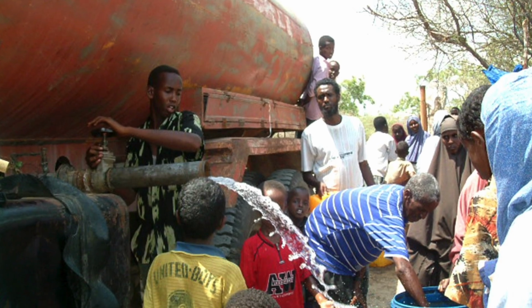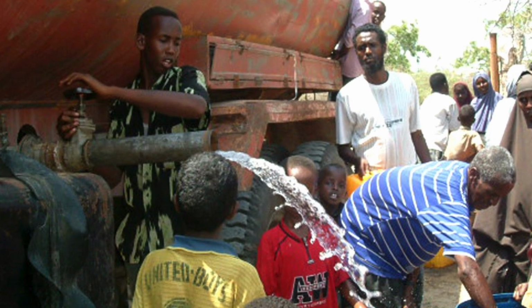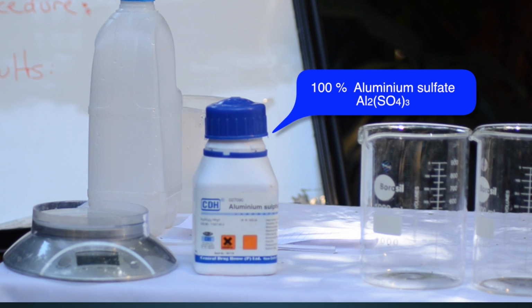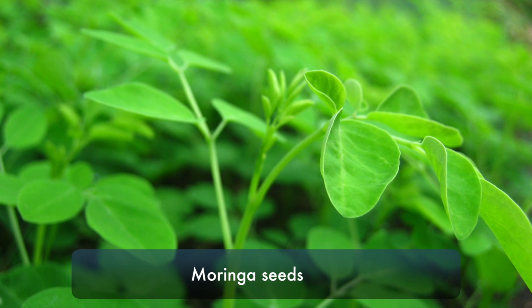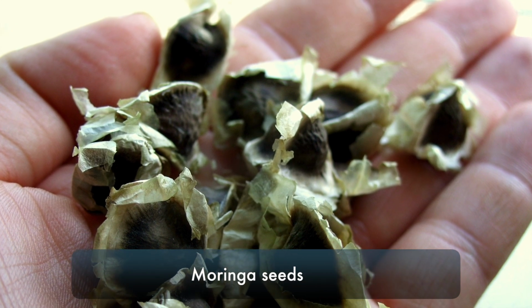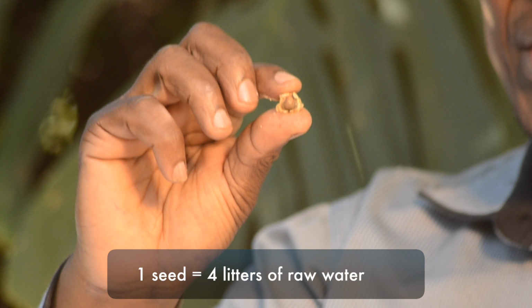In an emergency situation, the most commonly used chemical for coagulation is aluminium sulfate, or Al2(SO4)3. In case aluminium sulfate is not available in the field, another natural coagulant that is commonly used is the Moringa seeds. It's however mainly used at a household level. One seed can treat up to 4 litres of raw water, depending on its turbidity.